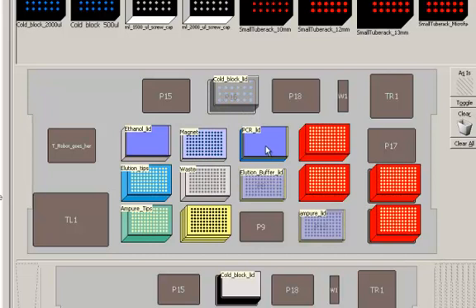Once it's done the transfer, the old plate is placed on the top of the stack and we continue processing the method. Here is where you're going to place your samples at P7 when you start the method. Right now it shows a PCR lid underneath that is a hard shell plate where your samples are placed in the wells corresponding to your pattern that you've set up in the method.